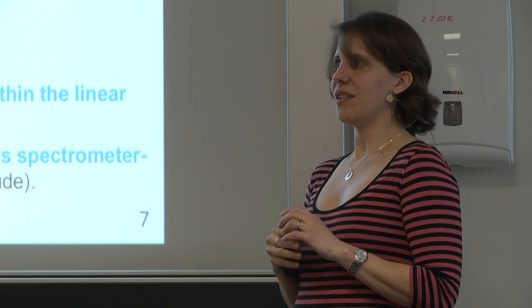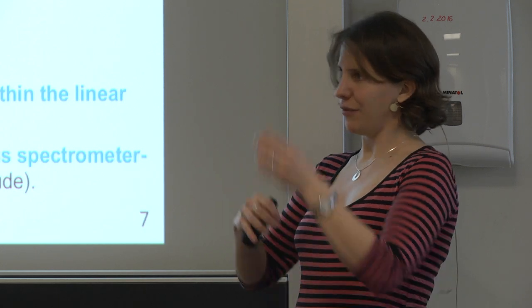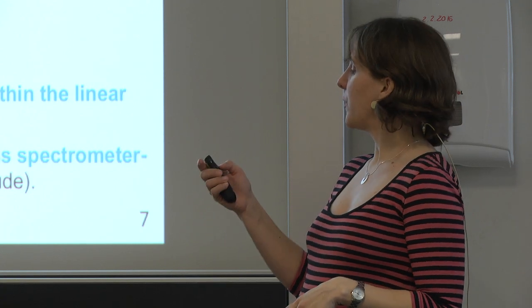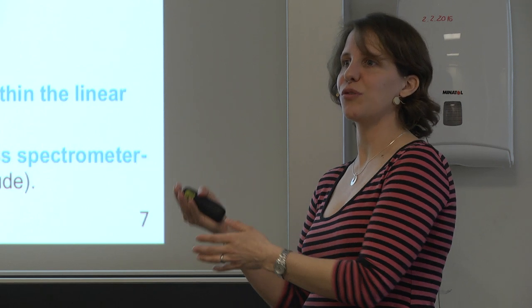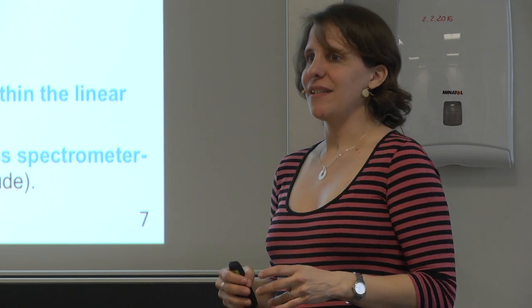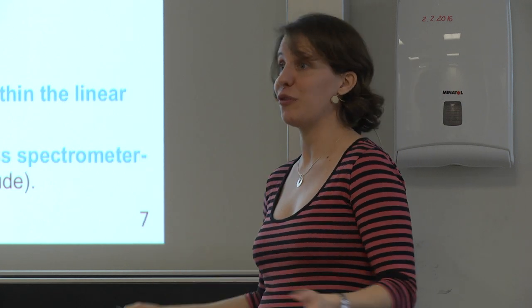So in most of the papers that are out there, and I'm talking about the label-free relative with thousands of quantitative values that are reported, what the people do is they just assume that all their measurement points are always coming from this linear range. And this assumption is made to give the quantitative values. And of course, it's impossible to quantify thousands of peptides and proteins and perform these linear calibration curves for all of them.